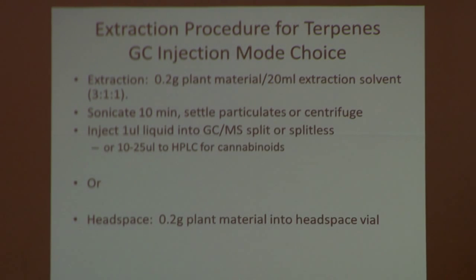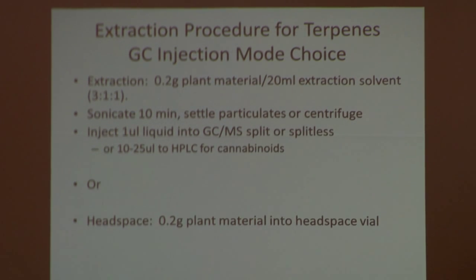Or there's another procedure here that works very, very well for the terpenes, and that's called headspace. In headspace, I could take about the same amount of plant material, about 0.2 grams, and put it directly into a headspace vial and seal it up, and that's it.